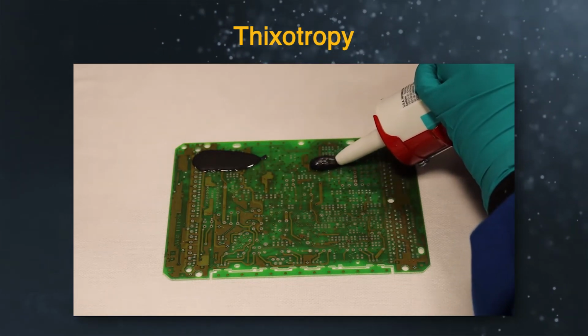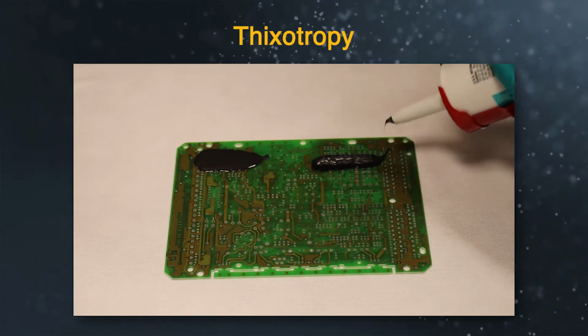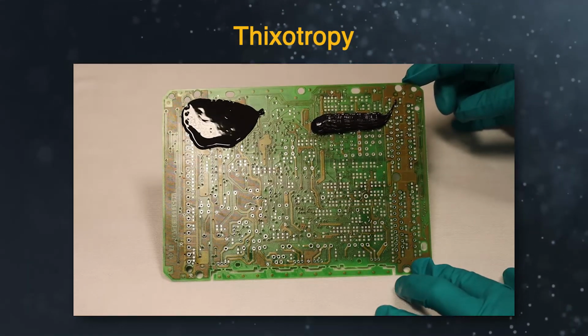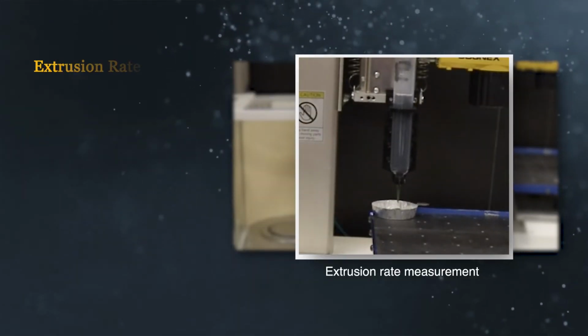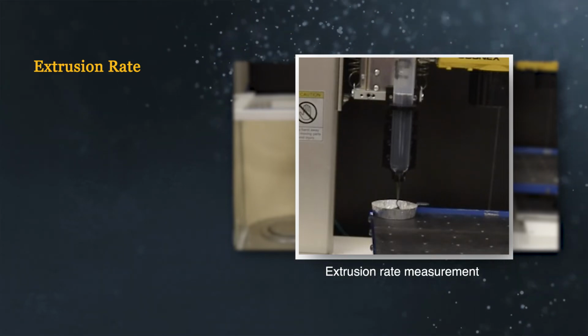If a material has a high thixotropy, it will flow when shear or pressure is applied, but remain unflowable after recovery. This is how gaskets and seals are dispensed, but remain unflowable after the dispense process. Many sealants and adhesives are designed to dispense as a bead or line with limited flow.